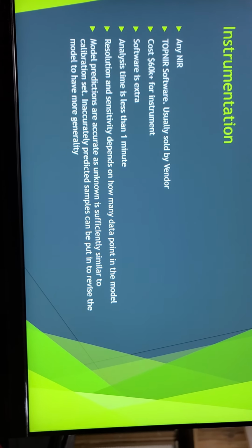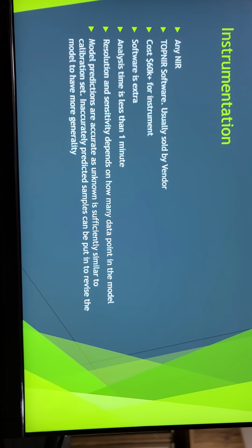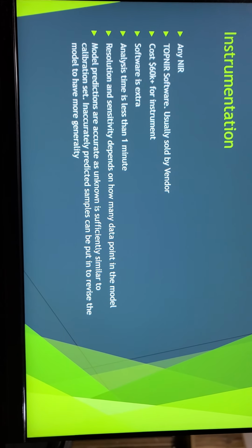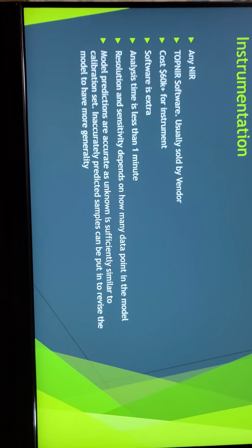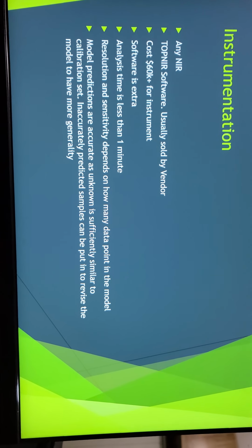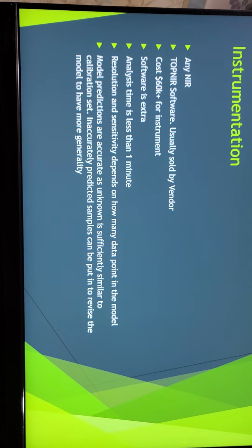Different vendors have their own different versions of this software, but they each do the same thing. They build a library and they create little envelopes of clusters that look at specific characteristics of that sample that you're looking for, and then cross-reference it to other nearby neighbors to predict your unknown.